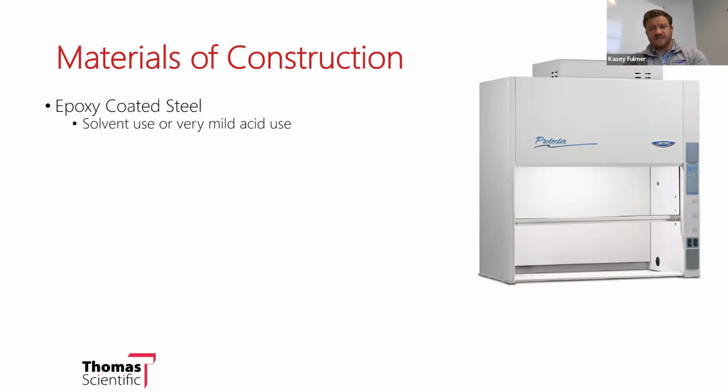The reason why you wouldn't want to use stronger acids is that if that epoxy coating were to chip or break or bubble at some point in its life and expose that raw steel, then you will eventually corrode the entirety of the interior of the hood.